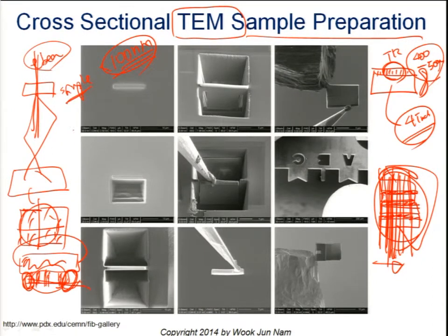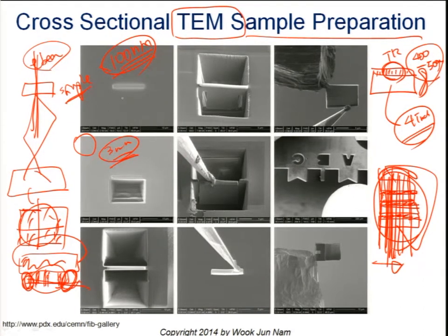drill, which has a 3 millimeter diameter. The reason the drill is 3 millimeters in diameter is, as you may remember, we can use any size of sample for the SEM, but for the TEM, the copper grid size has a fixed diameter of 3 millimeters.